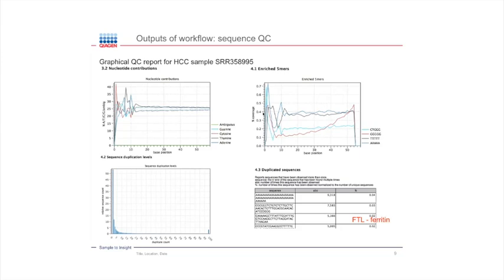The bottom left-hand plot shows the duplicated sequences. You can see that a lot of sequences are unique, and then there's this small little peak of sequences that are present multiple times, more than 100 times. And in DNA-Seq, if you're calling variants, this could perhaps be a source of amplification bias. Perhaps you'd be a bit worried about this. But in RNA-Seq, where you can have some short transcripts that are present at really high abundance, it's normally not something to be worried about.